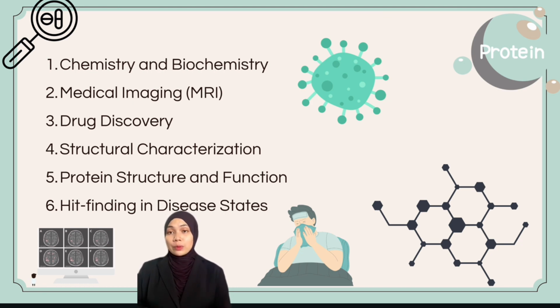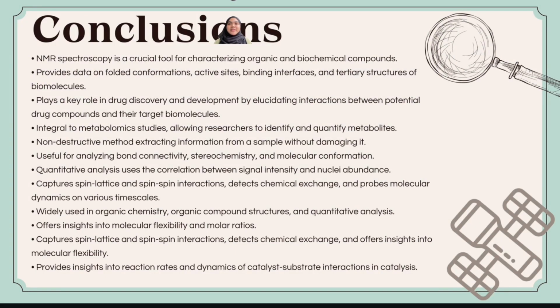Additionally, NMR spectroscopy is employed in hit finding in disease states by targeting protein structures and aiding in the identification of potential therapeutic targets, offering promise in treatment development. NMR spectroscopy is a crucial tool for characterizing organic and biochemical compounds. It provides data on folded conformation, peptide binding interface, and tertiary structures of biomolecules.